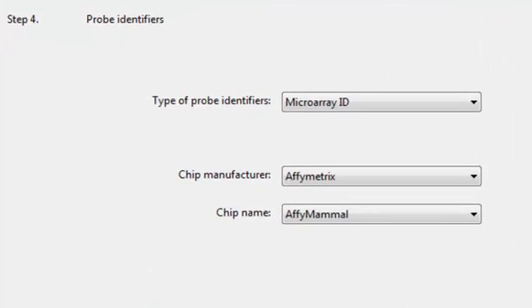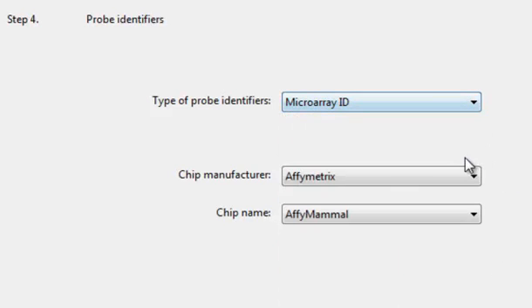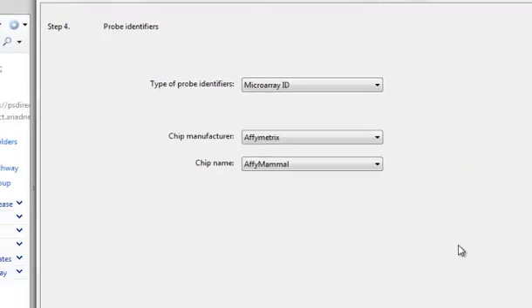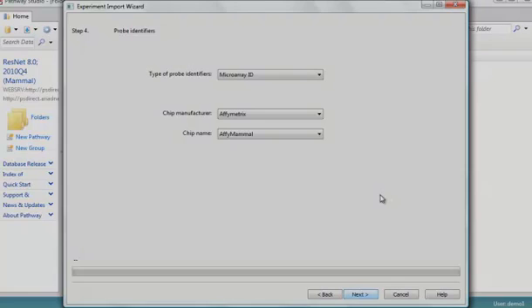So now the next step is mapping the identifiers. These are normally figured out perfectly, but if you needed to change them, you can map on different parameters. Now it's mapping the various probes in the chip to entities in the database, and this is an operation that takes a lot.